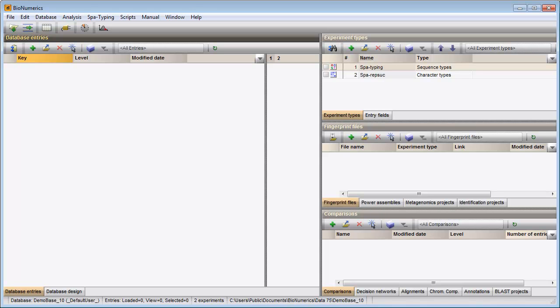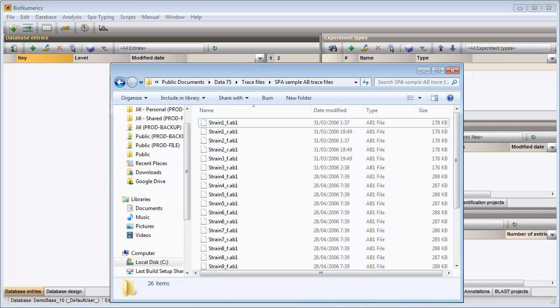In this video I will walk you through the import and assembly of a set of spot trace files. My dataset contains 26 Applied Biosystems spot trace files.